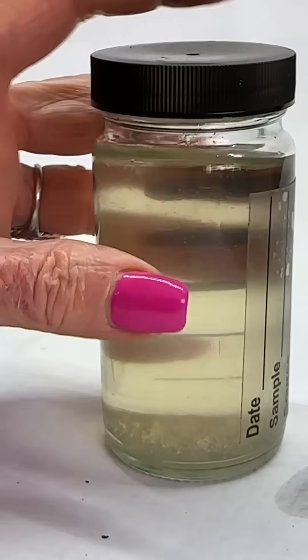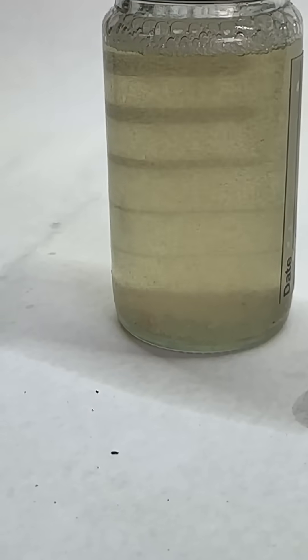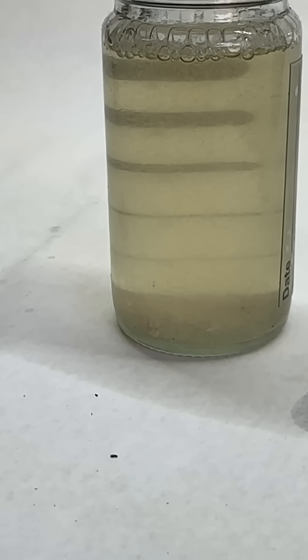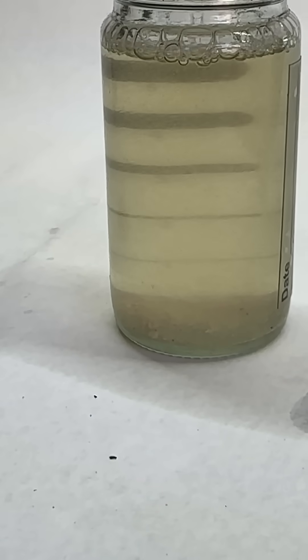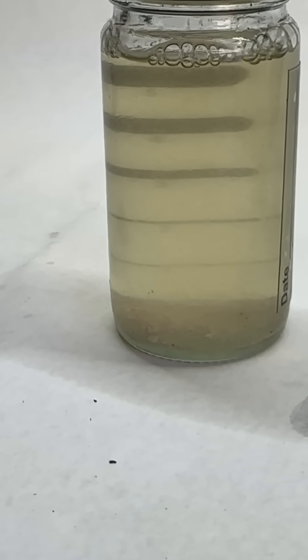Shake it up. That's good. Let it settle and you will see that this sample does have water in it, and the powder will be turning pink as everything settles.